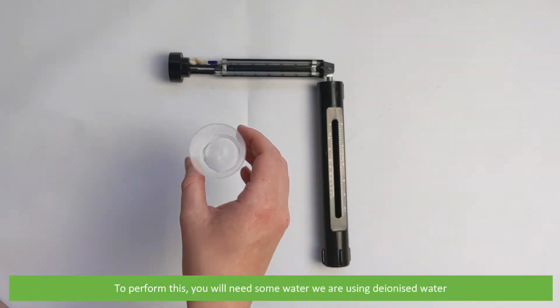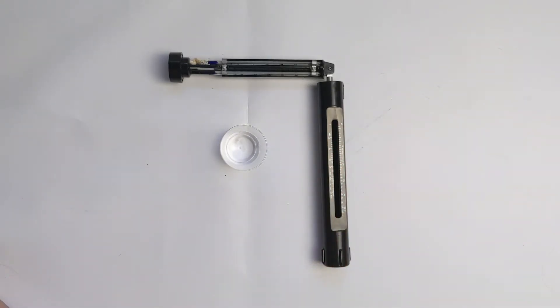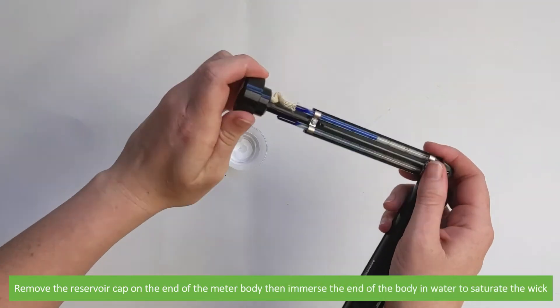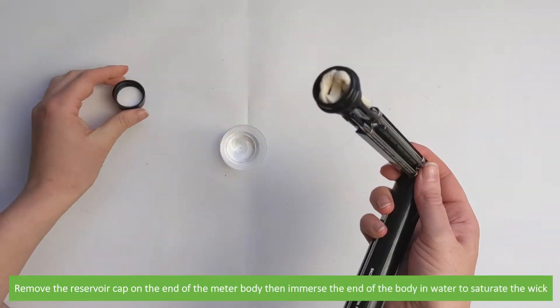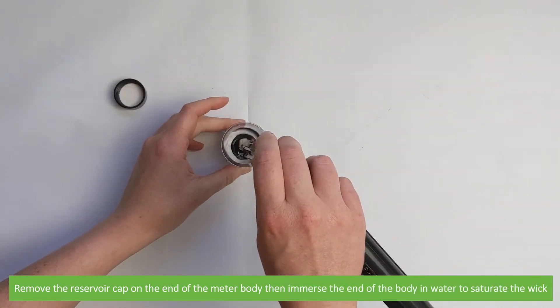To perform this, you'll need some water. We're using deionized water. Remove the reservoir cap on the end of the meter body, then immerse the end of the body in water to saturate the wick.